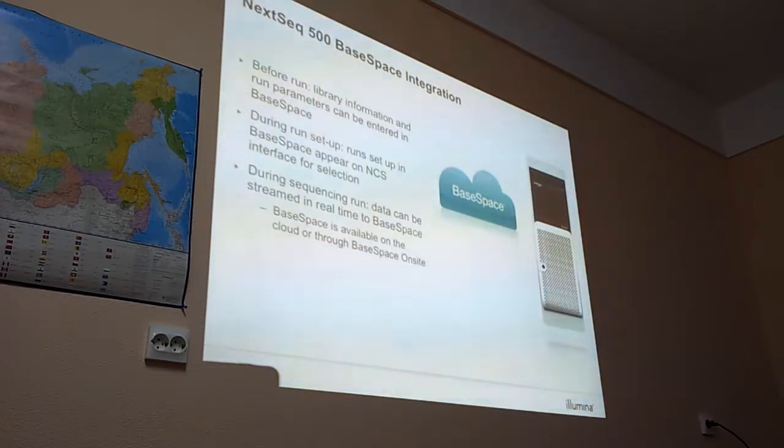But usually it should not be broken for more than 2 days. But you need to make the decision before you start the experiment. When you start the experiment, you need to decide whether you want to use BaseSpace in the cloud, BaseSpace on-site, or some local server.